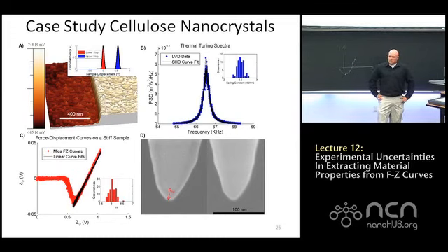So, recap our relative uncertainties for this particular experiment. This is just a case study that I've done, writing a paper on currently. Our uncertainty in CZ was about 10%. Our uncertainty in KL was about 5%. Uncertainty in M was about 3%. And our uncertainty in R tip was about 10%. Notice this is only the aleatory uncertainty. I haven't talked about the fact that the DMT model is not perfect. Turns out that's a much more complicated issue to address.